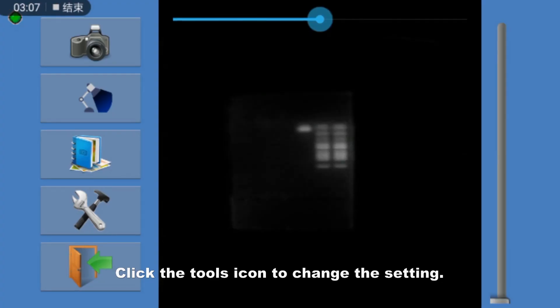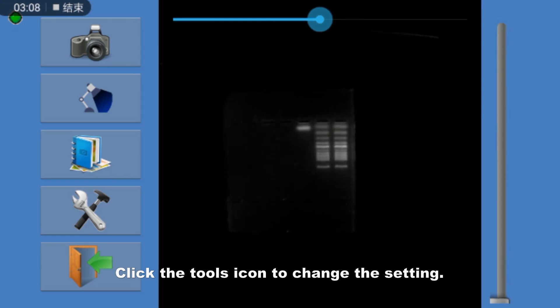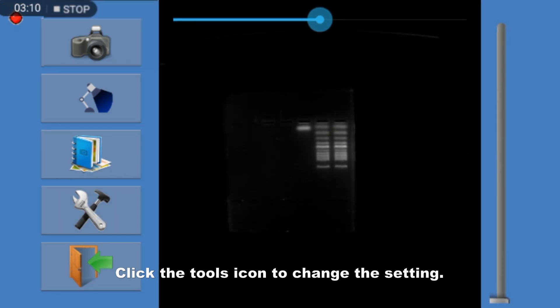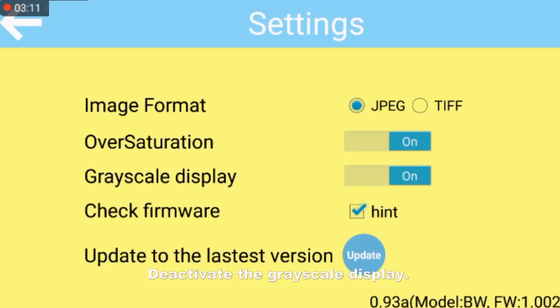Click the tools icon to change the settings. Deactivate the grayscale display.